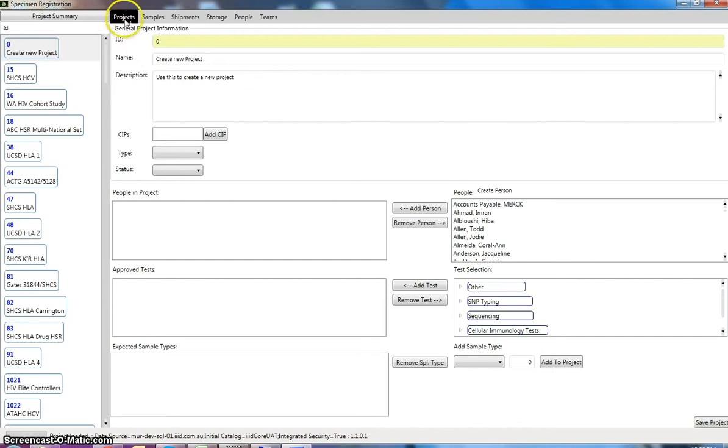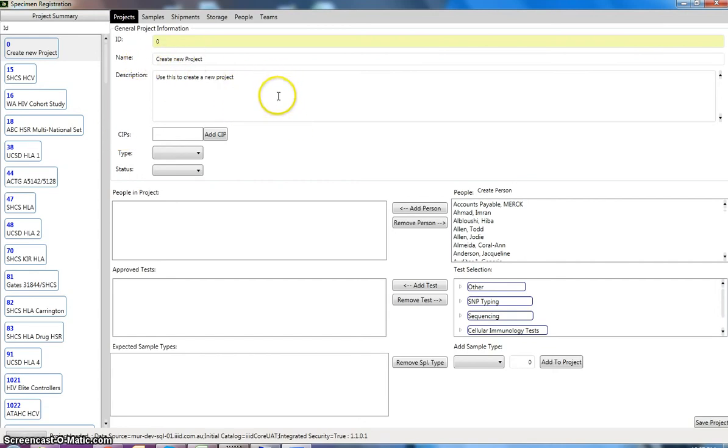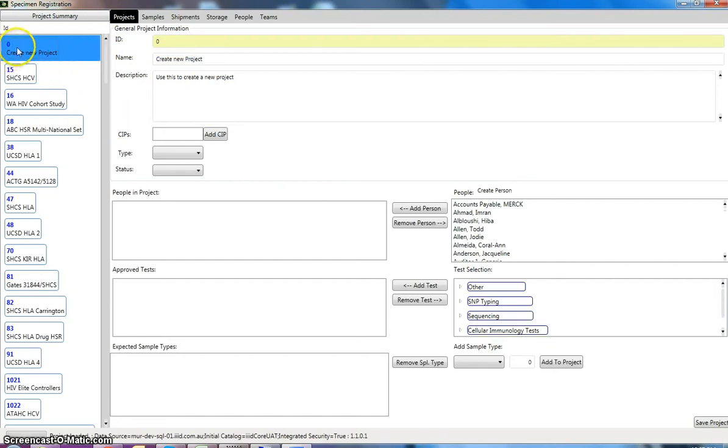Hello, welcome to our demonstration of the specimen registration software that we at IIID use to register samples so that they can be used in our LIMS system, our laboratory management system. The first thing that we have to do before we register samples is to create a project to put those samples into.